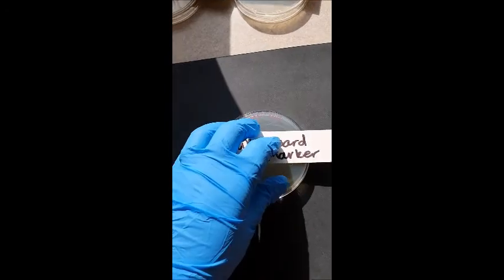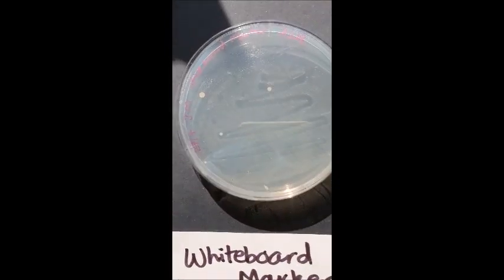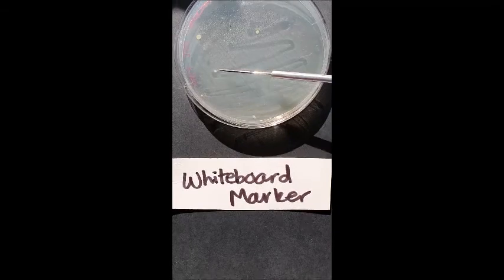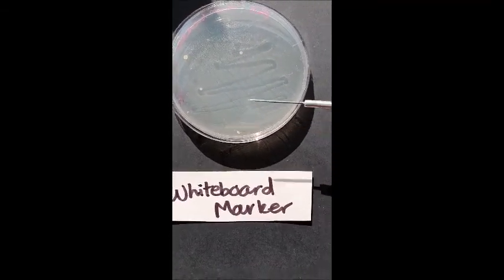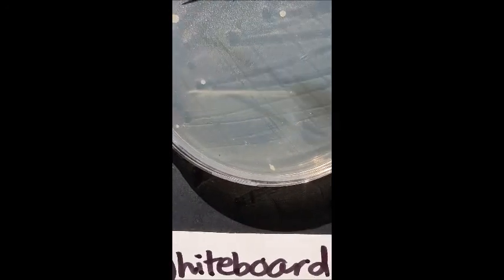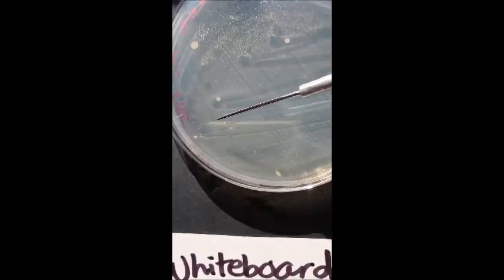So, the first one we're going to look at is the whiteboard marker, which you saw me take from the biology lab. If you look, it looks like we've got 1, 2, 3, 4, 5 colonies. Now they all look pretty similar. I think they're the same color. That one looks a bit darker, but I think that's because it's bigger, so it's got more mass and the color is deeper.